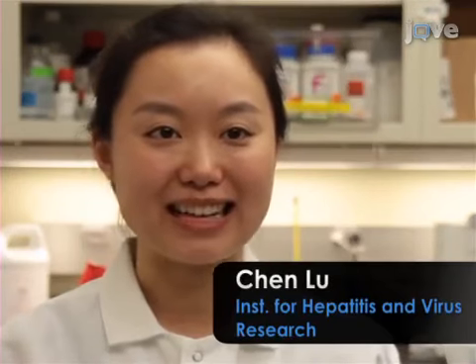This technique has several advantages over existing methods like HPLC. This method allows for detection of individual glycoproteins in their native status. It is faster and easier to screen glycosylation alterations for multiple proteins simultaneously.